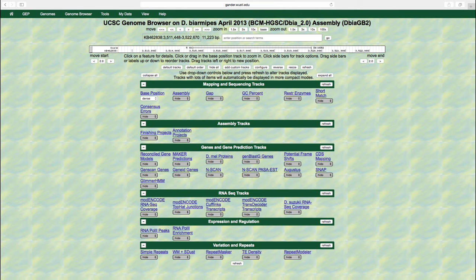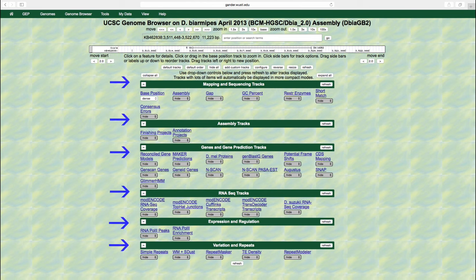Along with displaying the genome sequence shown at the top of the genome browser image, the genome browser also allows us to view various tracks aligned with the genome sequence in the lower portion of the browser image.